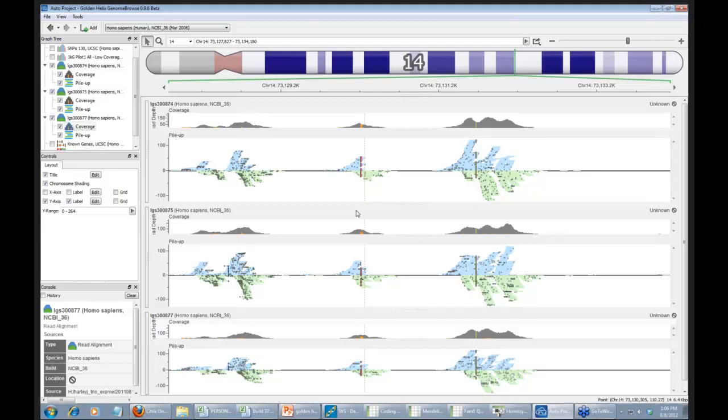Here's another question. Was GATK local realignment used around indels to reduce false positive SNP calls? So all of the data that we're working with is coming from 3 different sequencing cores, and they run the bioinformatics.